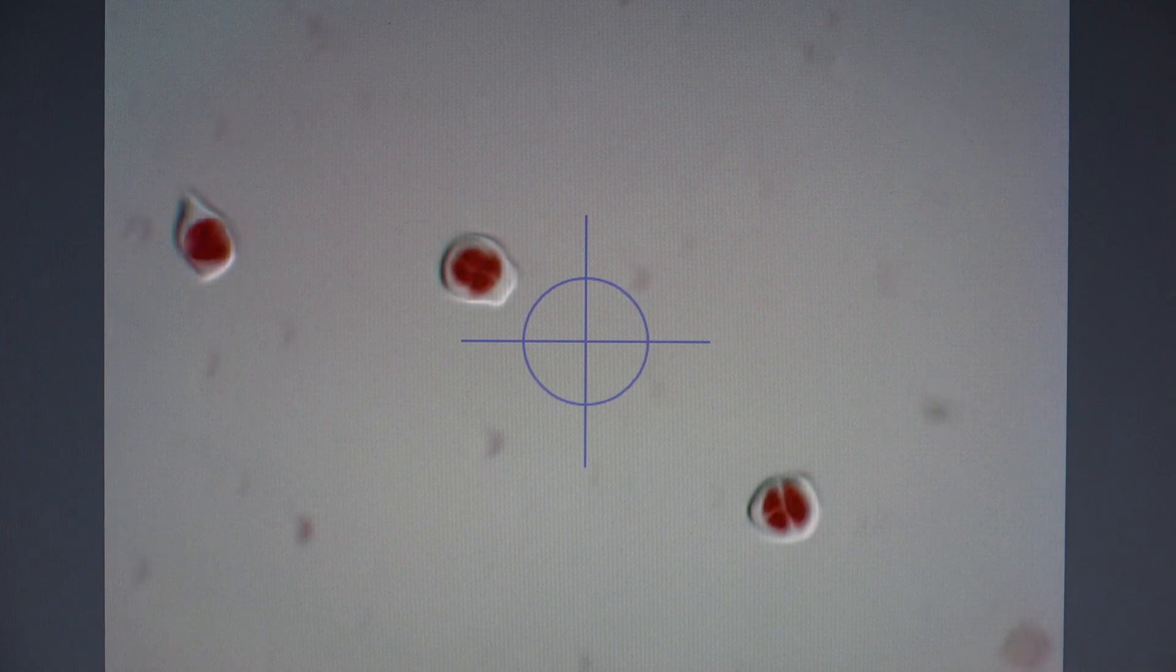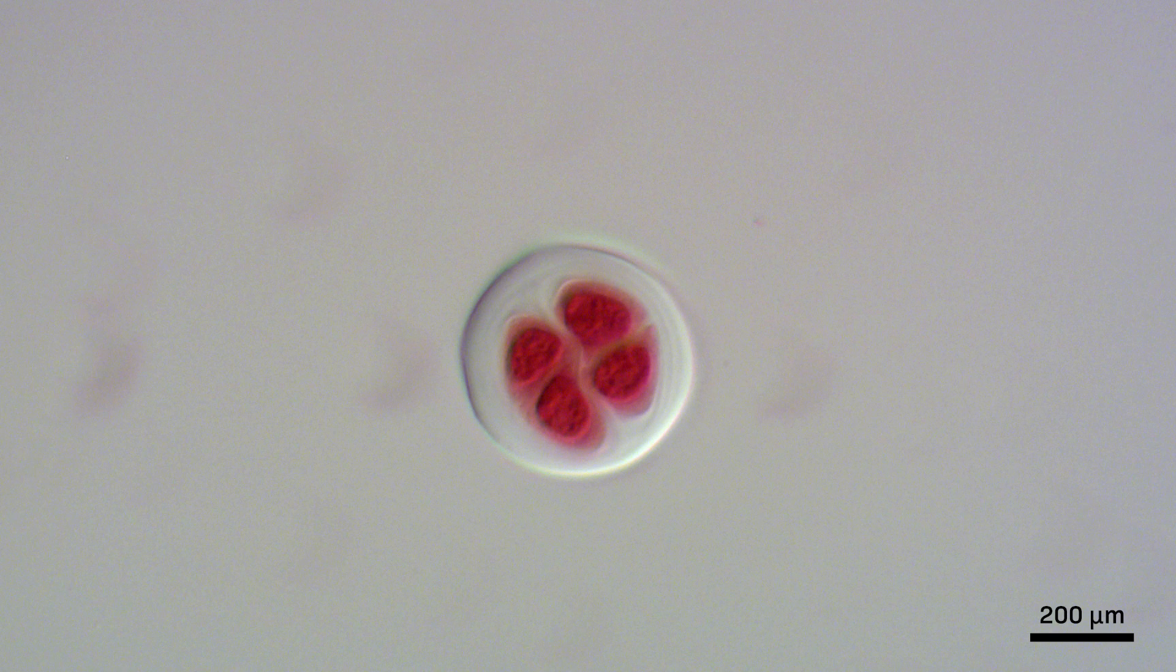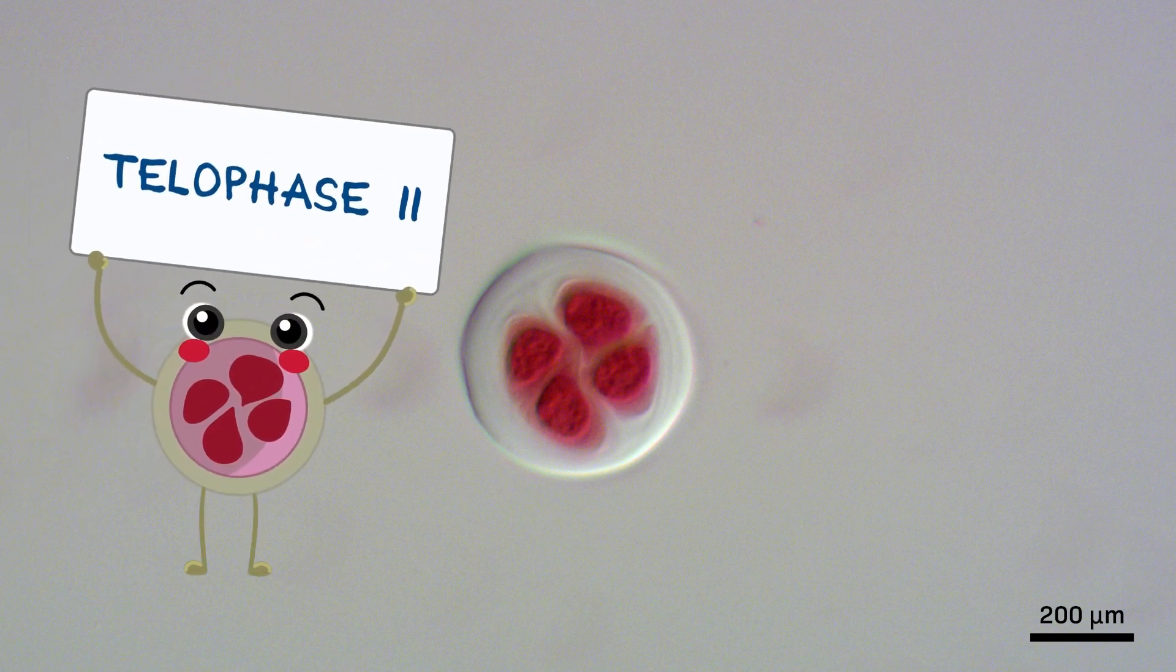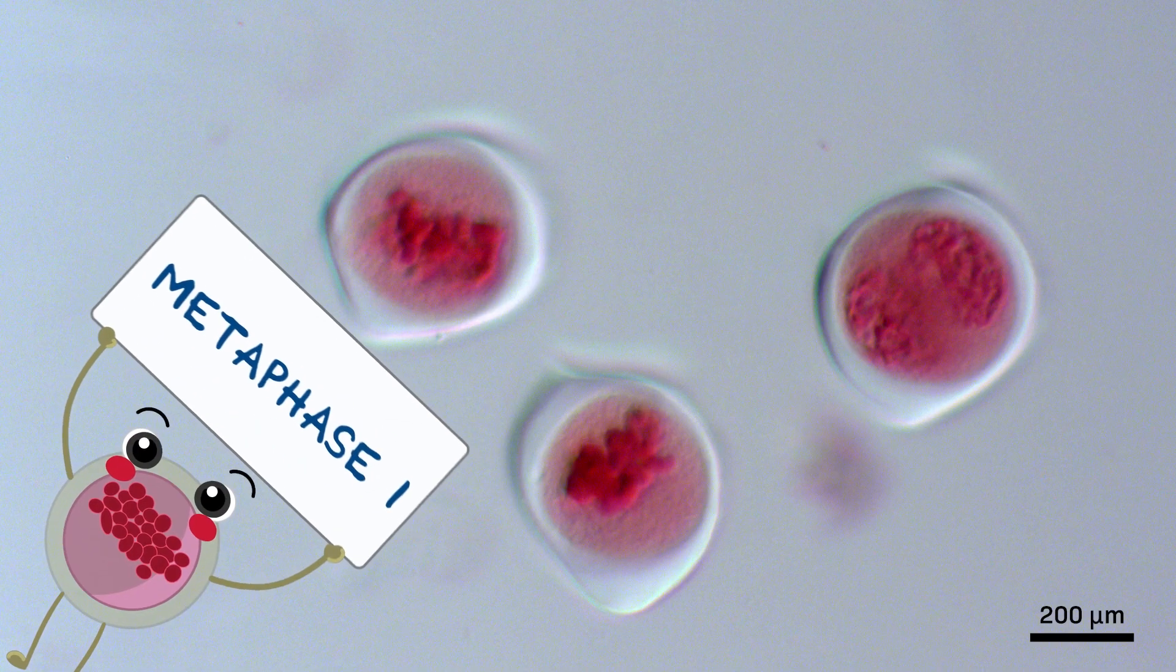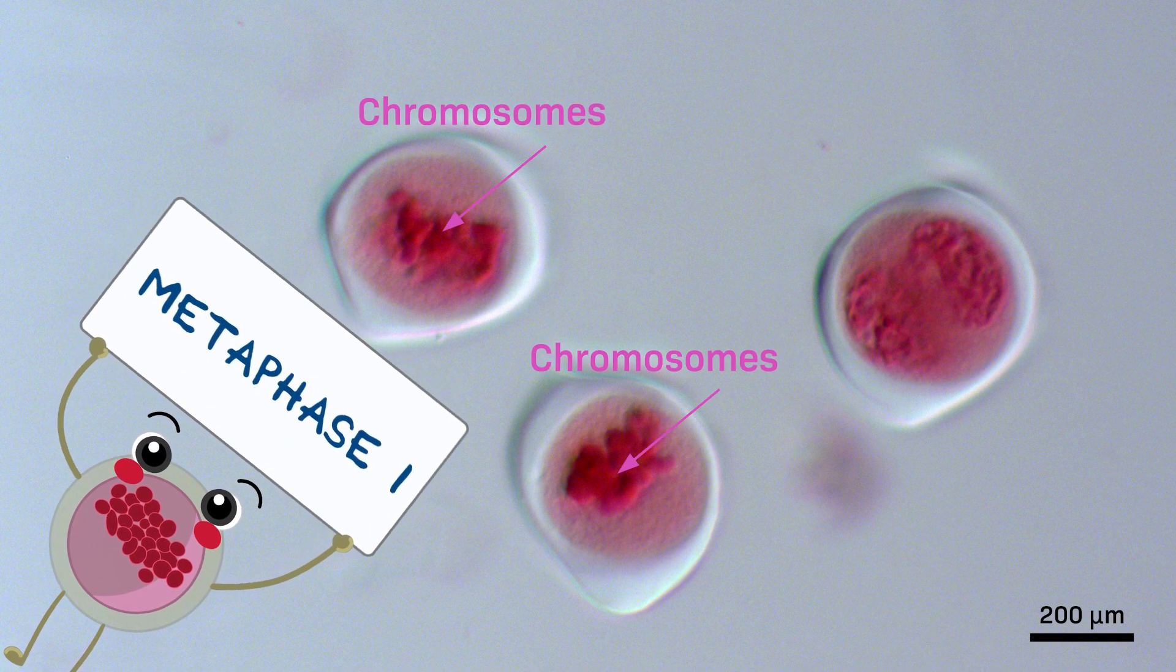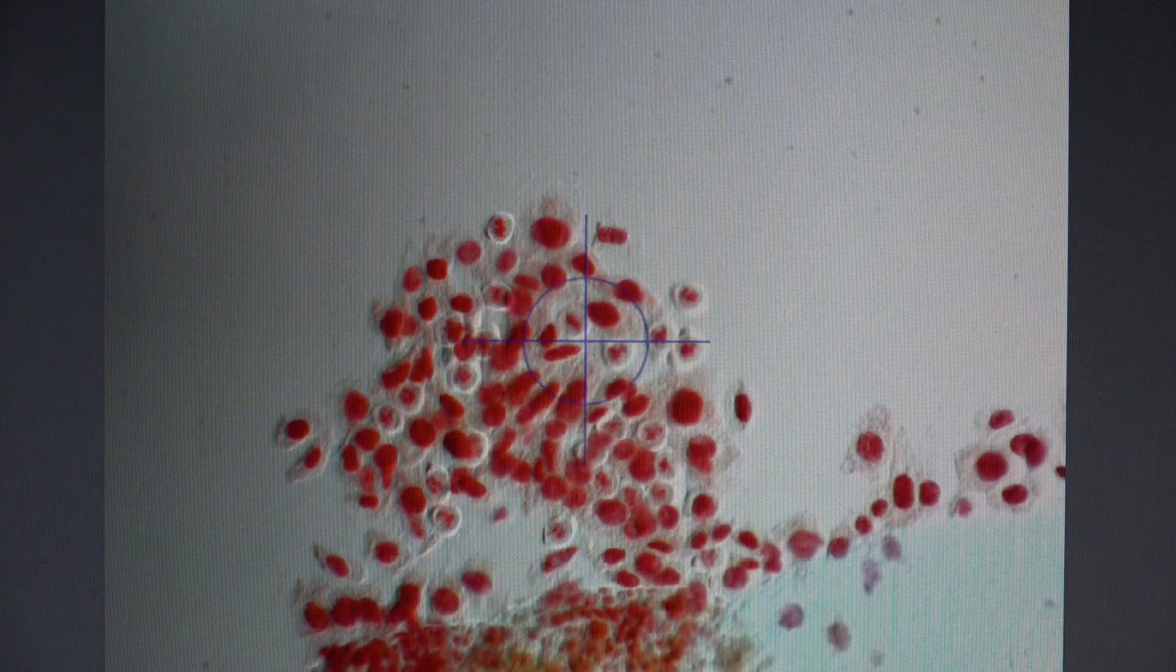Okay, let's see. Focusing. Here are some meiotic cells! Oh my gosh. Okay, this is definitely telophase two because I'm seeing four nuclei here, so everything's already split up. This looks like metaphase one. I can see all the chromosomes lining up at the center of this cell. Oh my gosh.